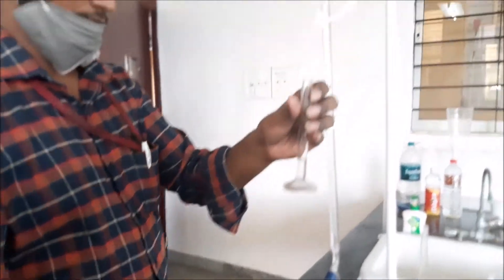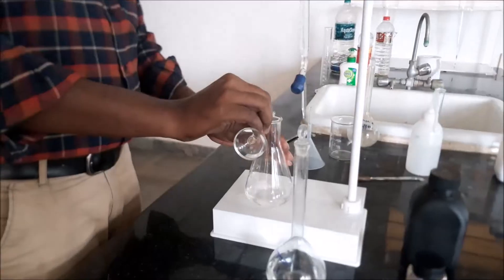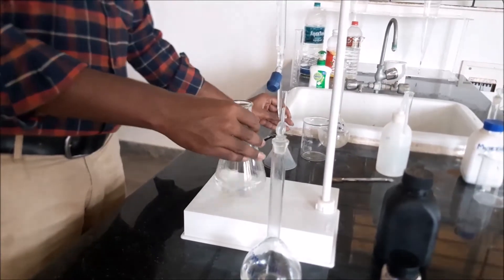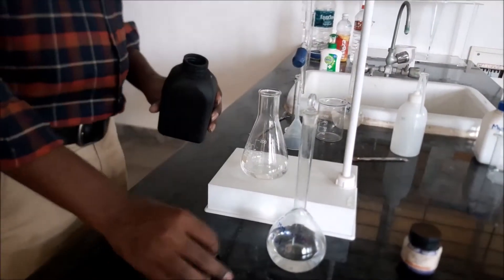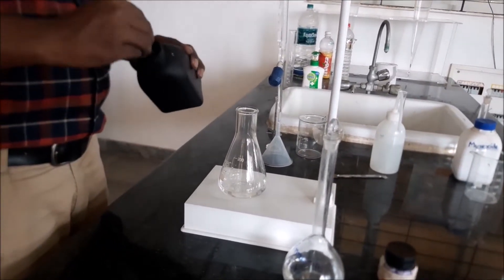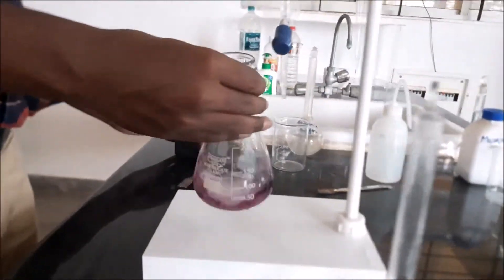2 ml of ammonia buffer solution is added to the sample before adding the indicator. This helps in showing the change in colour for the sample. Now the indicator Eriochrome Black T is added — a pinch of Eriochrome Black T — and there is a slight change in colour which turns to wine red.